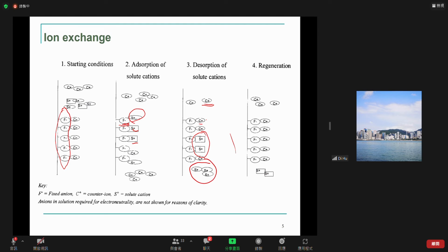And if we are using a diluted salt, we can use different ion strengths, which means concentration. The concentration of the counter ions, the type of the counter ions, and also the pH all play a very important role in how fast they are eluted. All of them influence the retention.